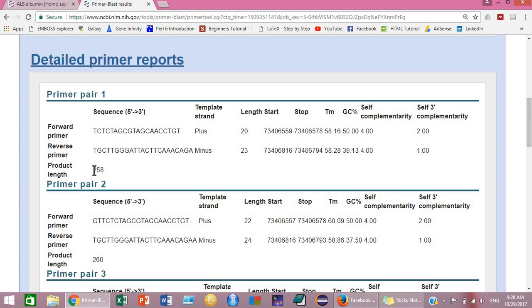This is the forward primer and this is the reverse primer. This is the product length, 258, and these are the lengths of the forward and reverse primers.